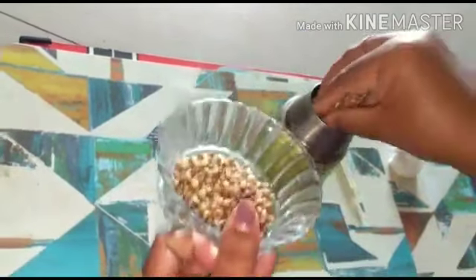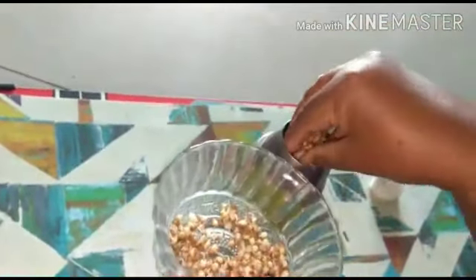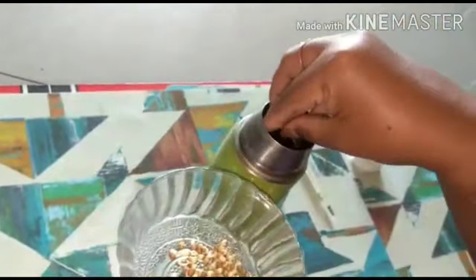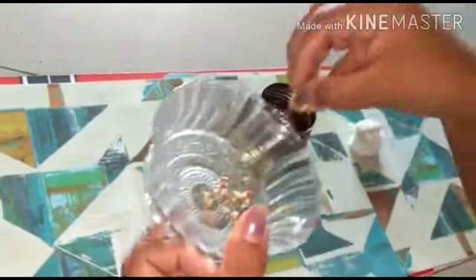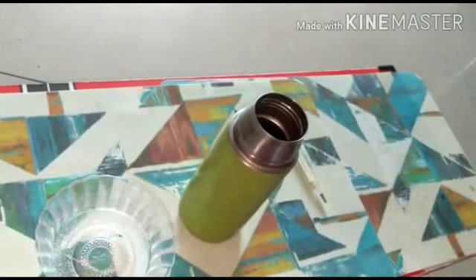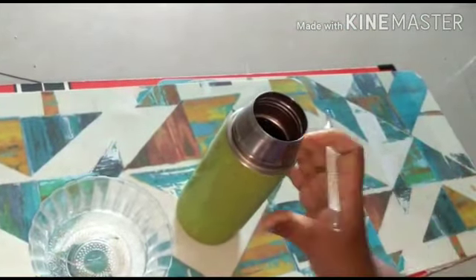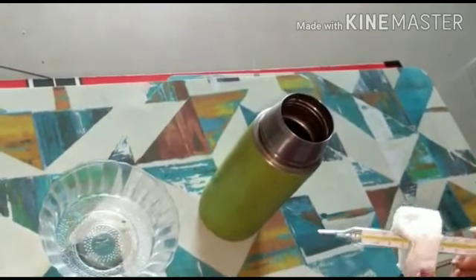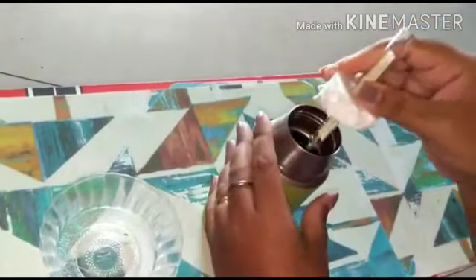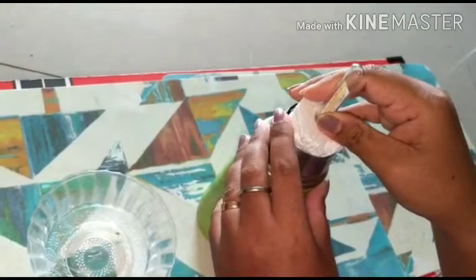First, take the germinating seeds into the thermoflasks. After placing the germinating seeds into the thermoflasks, insert the thermometer into the prepared cork, and see that the bulb of the thermometer is dipped into the germinating seeds.